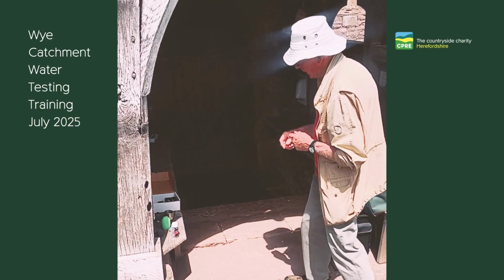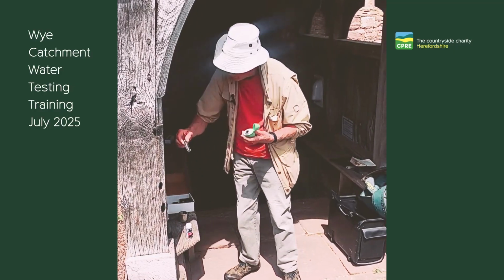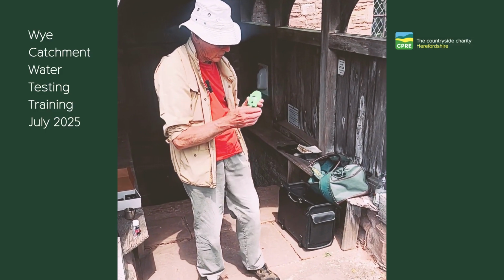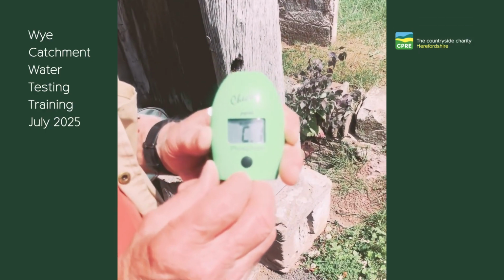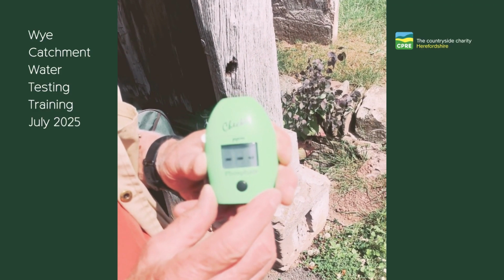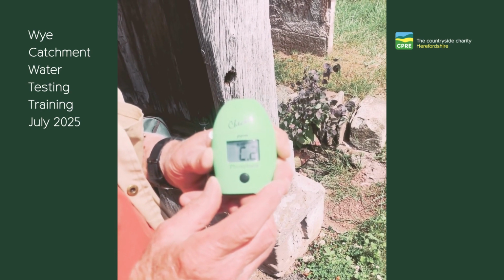So going back to the tester, the checker, the first step is to put the blank sample, the calibration sample, which has nothing in it other than water, into the device, close it, press the button. We're now getting a display which says add C1, press. C1 is cuvette number 1. So now I press, and it's now calibrating, now thinking about calibration, and now it's saying add C2 and press.